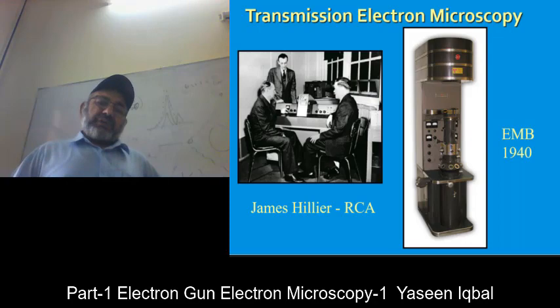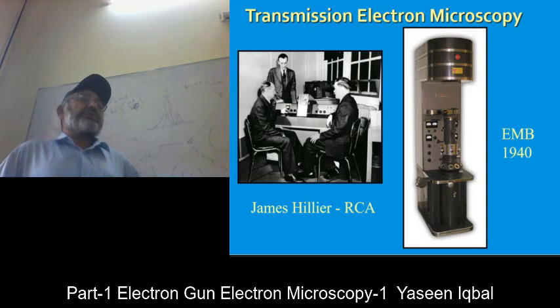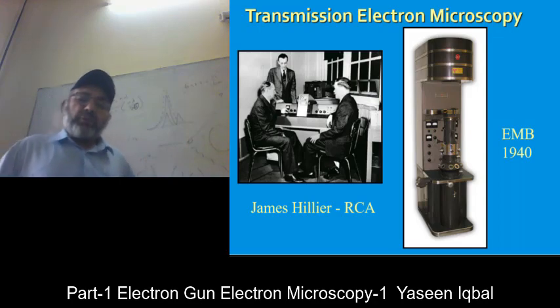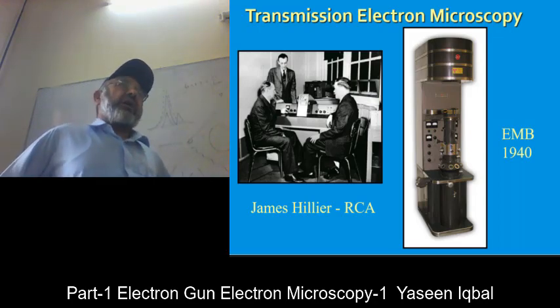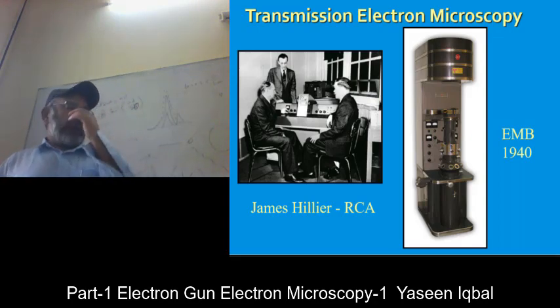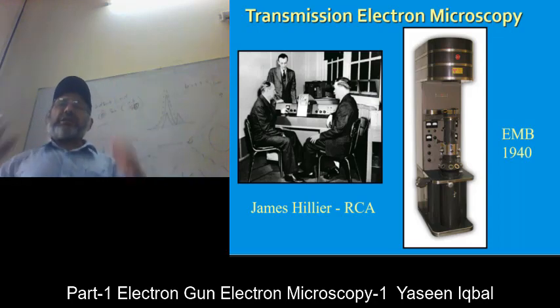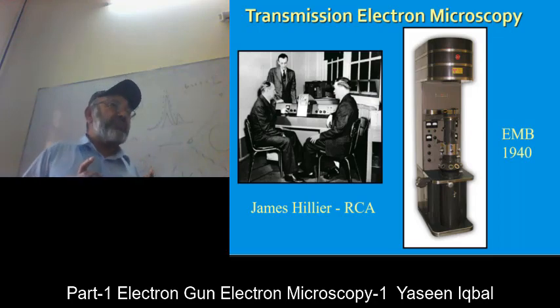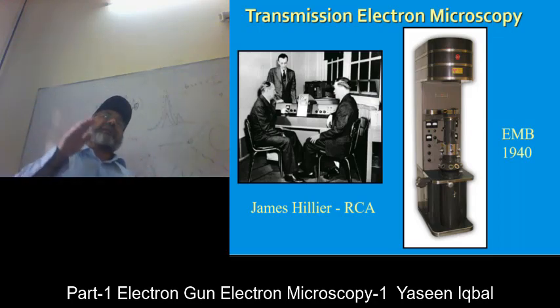And this course contains the various parts and the constitution of the electron microscope. So I am going through these one by one, how the electron microscope works and what sort of resources are used, how the electrons are produced, how they are thinned down into a very thin beam, then how they are accelerated inside the microscope, then interact with the sample, then are projected onto the viewing screen.